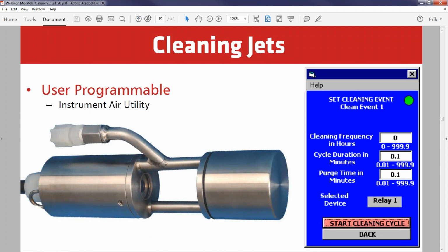And typically, most samples that we see for turbidity are going to be in the range of either at atmospheric, if they're submersible or whatever the water weight above it is, not too much, to about 60 to 70 psi. So obviously we want to have pressure in the neighborhood of 30 to 40 psi higher than the pressure for that to work in a pressurized system or in a plate mounted one.